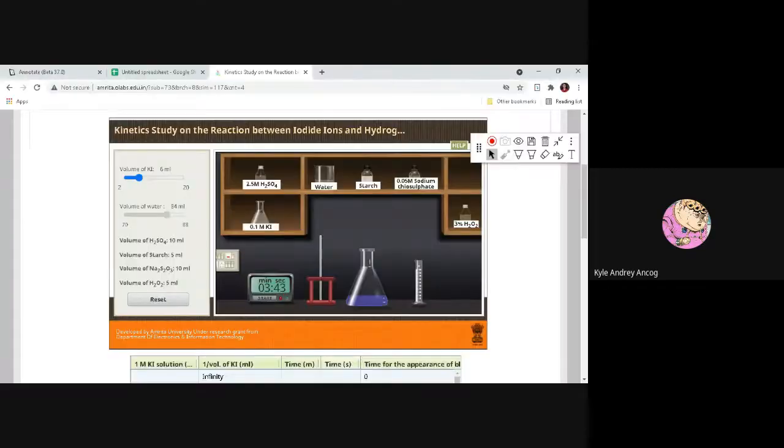So here, the indicator that there's a reaction that has occurred is our change of colors. It's not white anymore, ma'am. Evolution of gases. Okay. What, Adrian? I can't see anything. White. Be patient, class. Okay, so we have that one. At least we can see it now. Okay, all right.